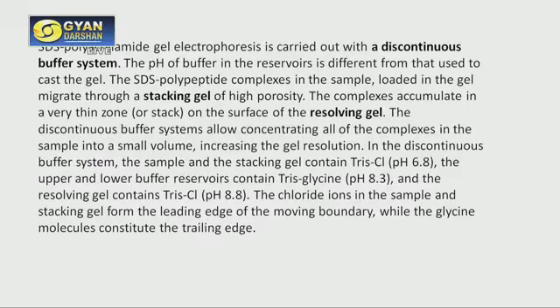And the stacking gel has a pH of 6.8, Tris-Cl pH 6.8. The upper and lower buffer reservoirs contain Tris-glycine pH 8.3. The resolving gel contains Tris-Cl pH 8.8. So you can see three different pH systems are present. That is why we call it a discontinuous buffer system.